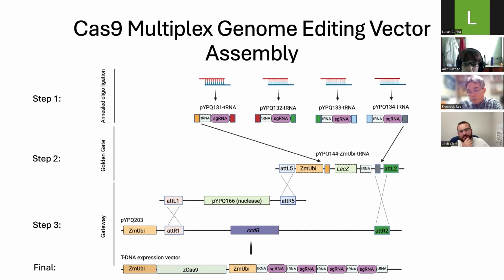Are you referring to Csy4? I couldn't quite hear. Yes. The Csy4 protein to enhance the guides. Okay, so yes, Csy4 I think is the one we're talking about.